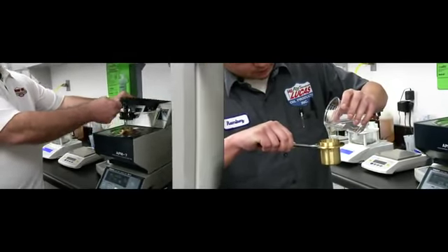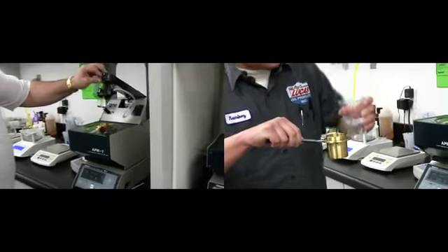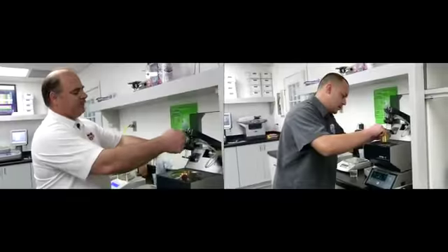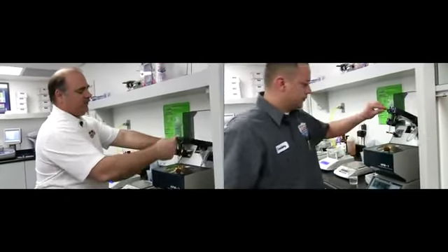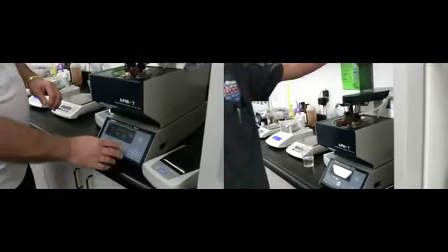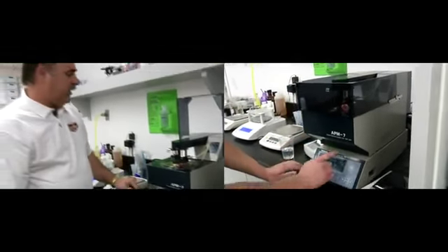And this is a little different than the Cleveland Open Cup, which is this tester here, in the fact that there's a rotor that turns very slowly, and it allows the fumes to be built up within this headspace, and then you introduce an ignition source and then detect the flash, which is then reported on a hard copy.